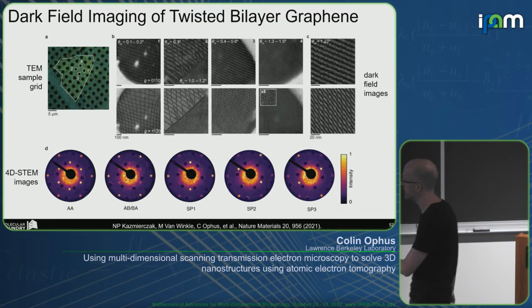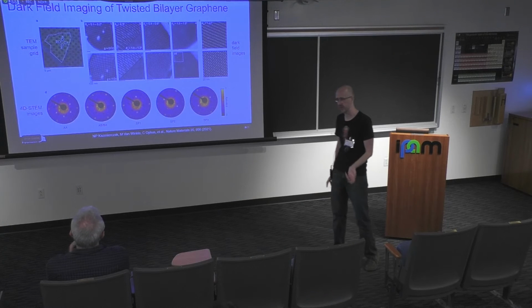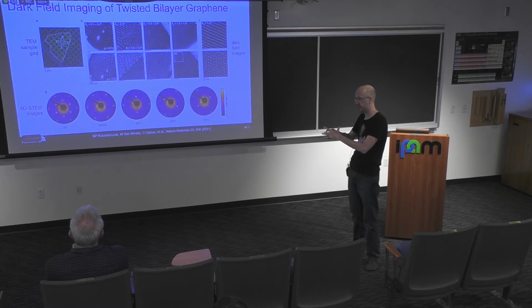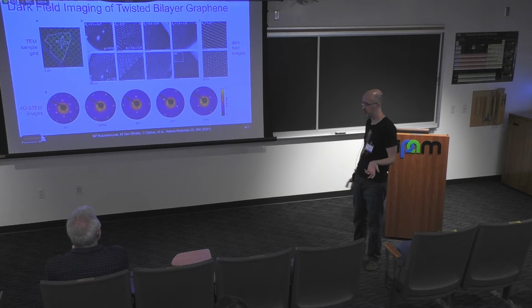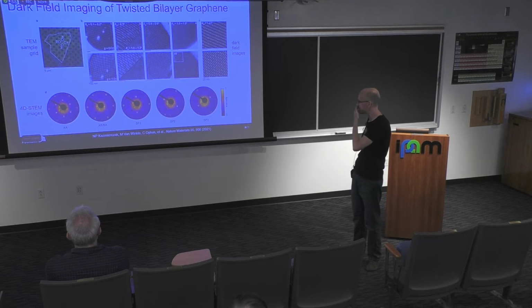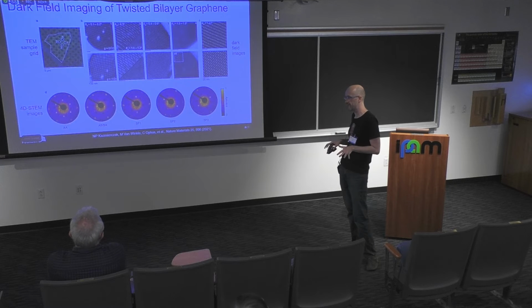So what I just want to show you here is that's what AA stacking looks like, or AB stacking, on the two left-hand diffraction patterns. And you can really see the innermost ring is constructively interfering more for AA, and then for AB, it's the outer ring, the second ring of diffraction spots. And then saddle point are the 3 edges of alignment here. And so these, again, are fingerprints for the local deformation or local relaxation of the 2 graphene layers with respect to each other.